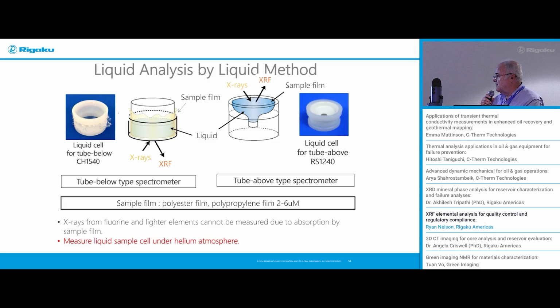One thing you have to be wary of course, with sulfur material, if you're looking at fuels, is a sublimate, and you'll end up with a sulfur contaminant in your machine if you should leave it in there. So there's some material you have to be a little careful with handling.